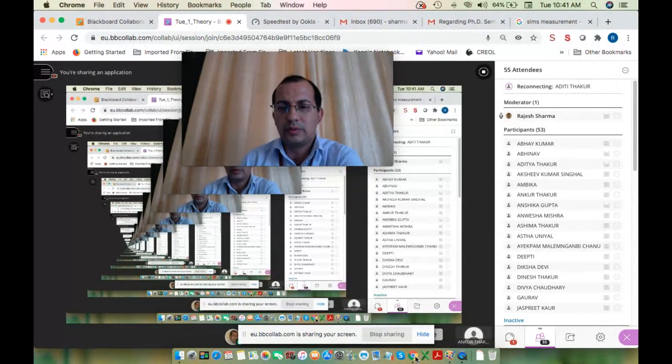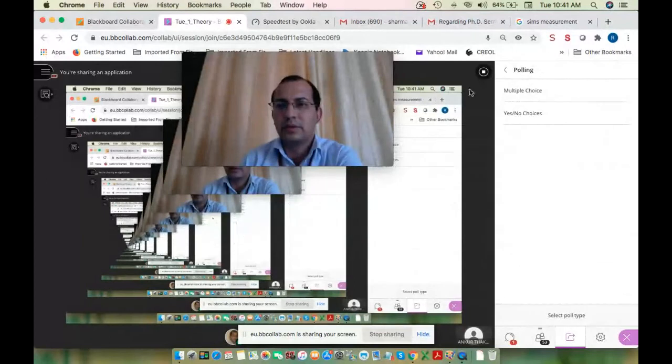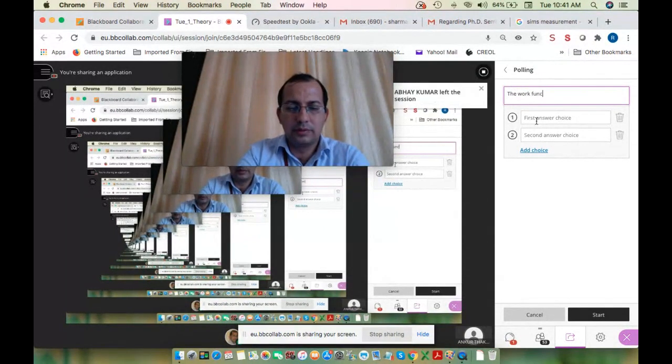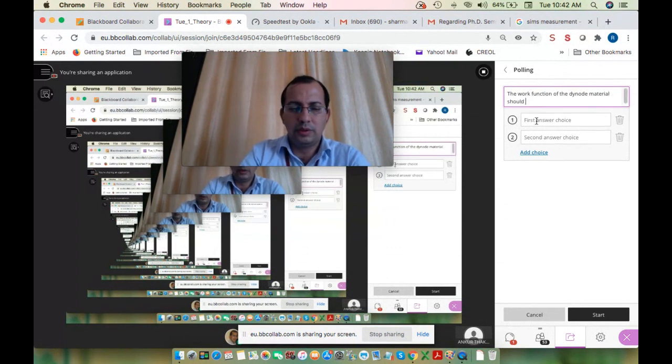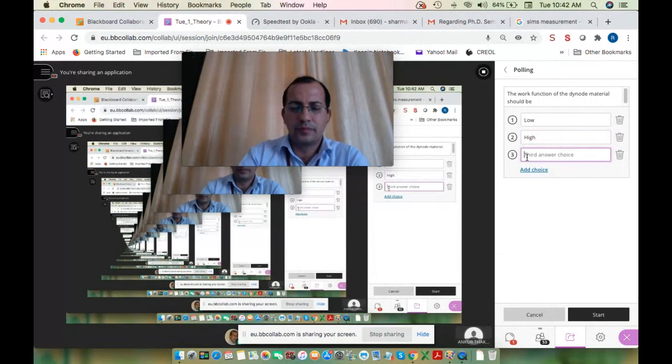Let's have another query. The work function of the dynode material should be low, high, or no effect.